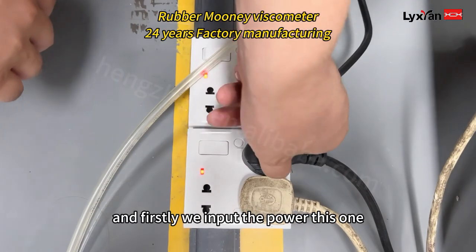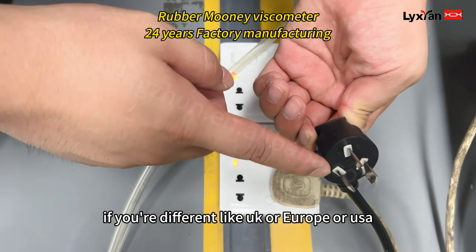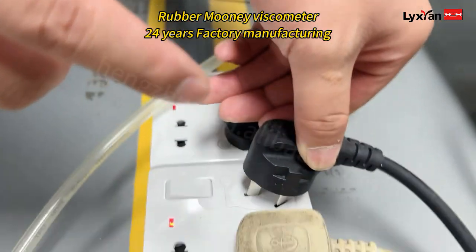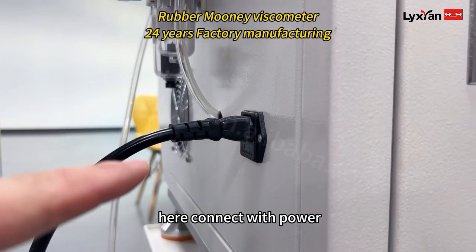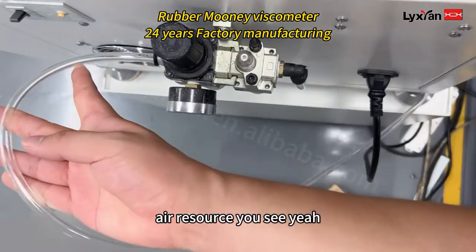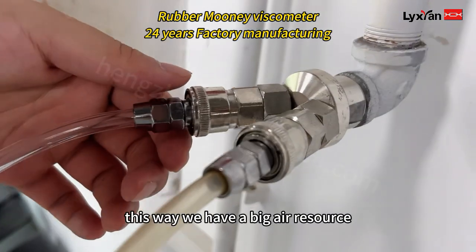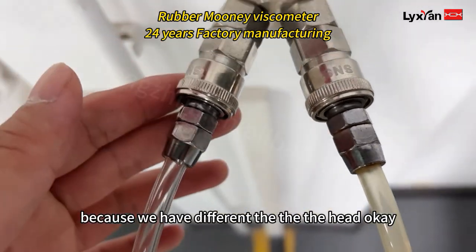First we connect the power. This plug is Chinese standard — if you need a different standard like UK, Europe, or USA, just tell us which country you are from. Here we connect with power, and here we connect with the air resource. The air resource connects here, and it comes from the big compressor. We connect with it here because we have a different head fitting.